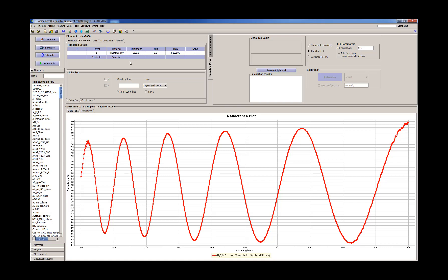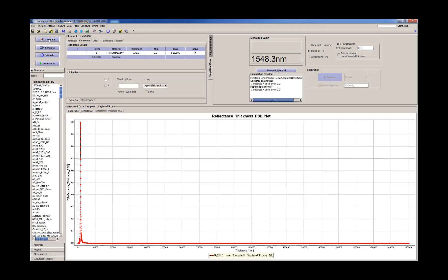So the first thing we'll do is estimate approximately the thickness. We'll just select the thickness as a calculated parameter, use the thick film algorithm and calculate. So it gives us about 1.5 microns.